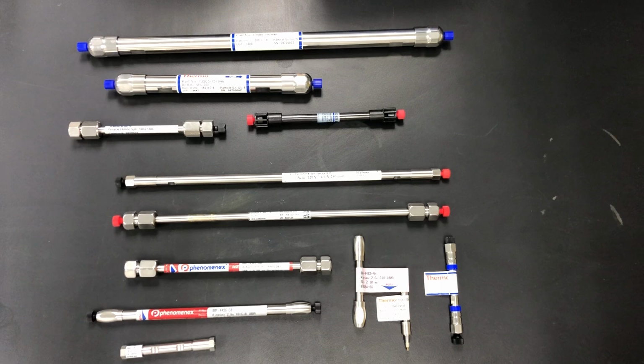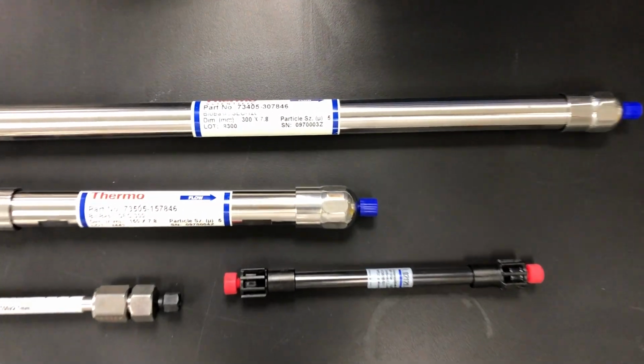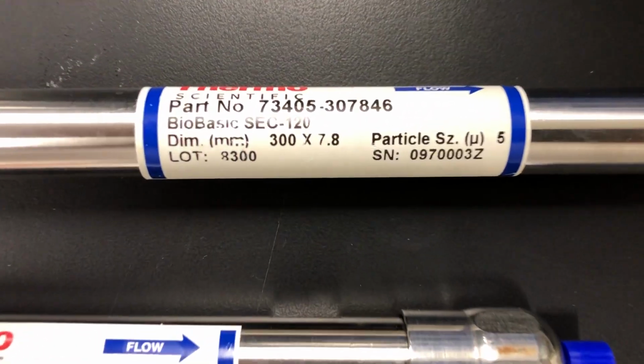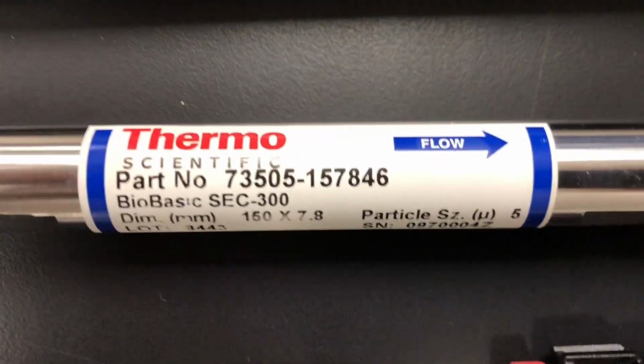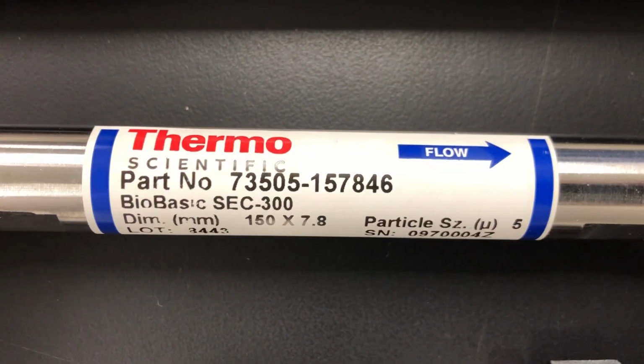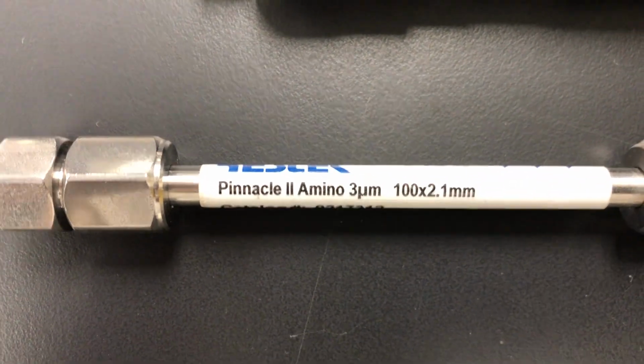HPLC columns come in a fair distribution of sizes. They're typically going to be between 50 millimeters and 200 or 300 millimeters. Here we have a pretty big one. This is actually a size exclusion column, and it's 300 millimeters long. Here's one that's 150. Both of these are pretty thick. They have pretty big inner diameters. You can see they're wider tubes.